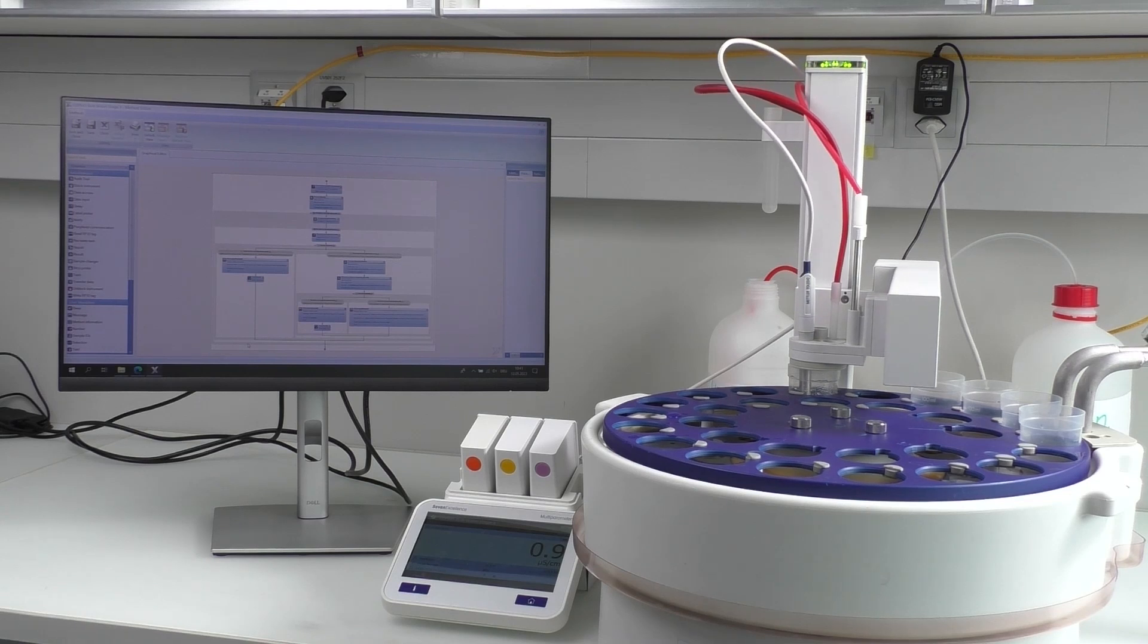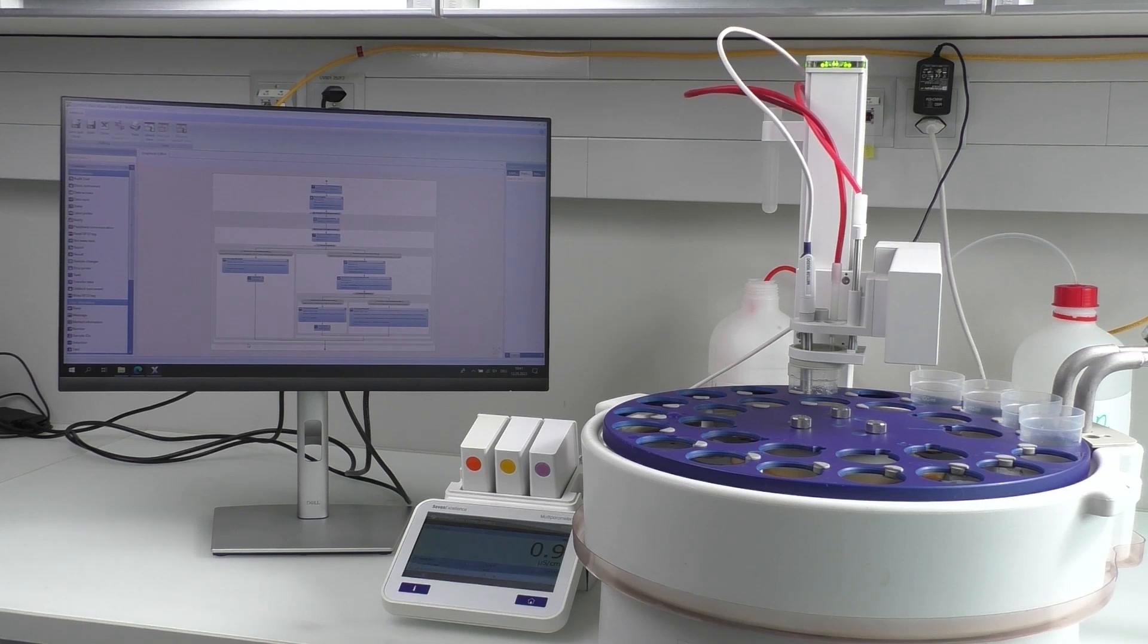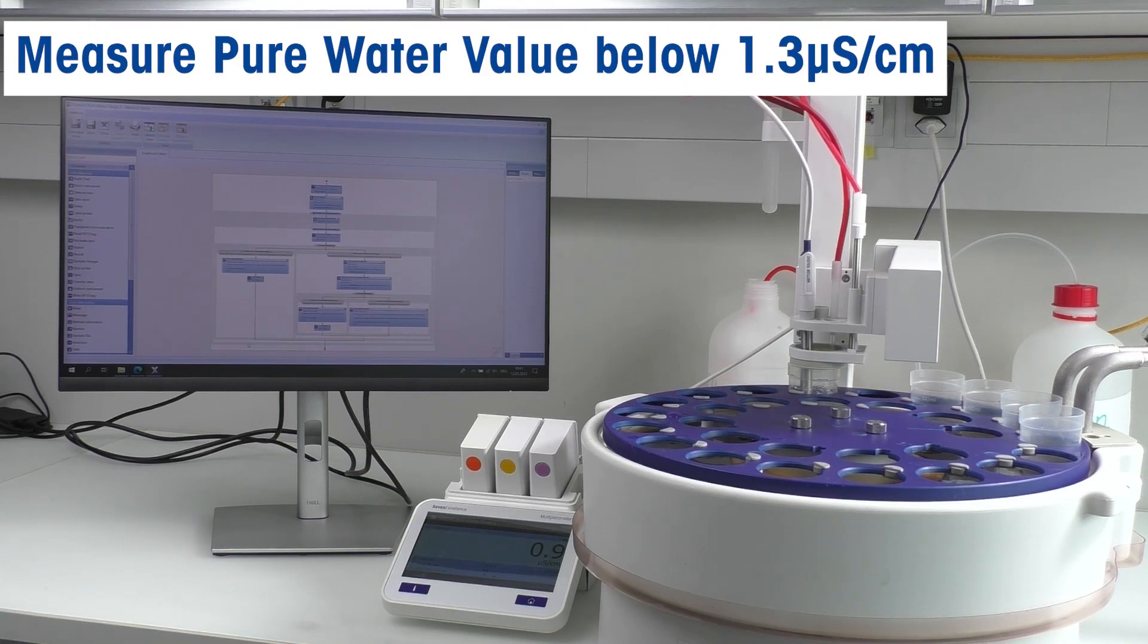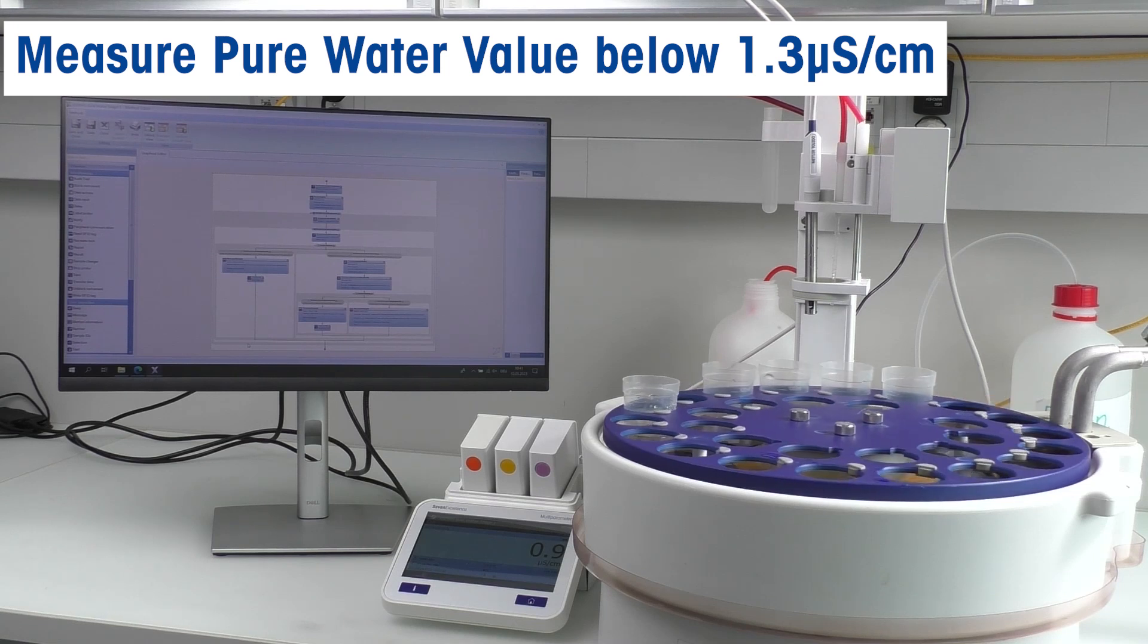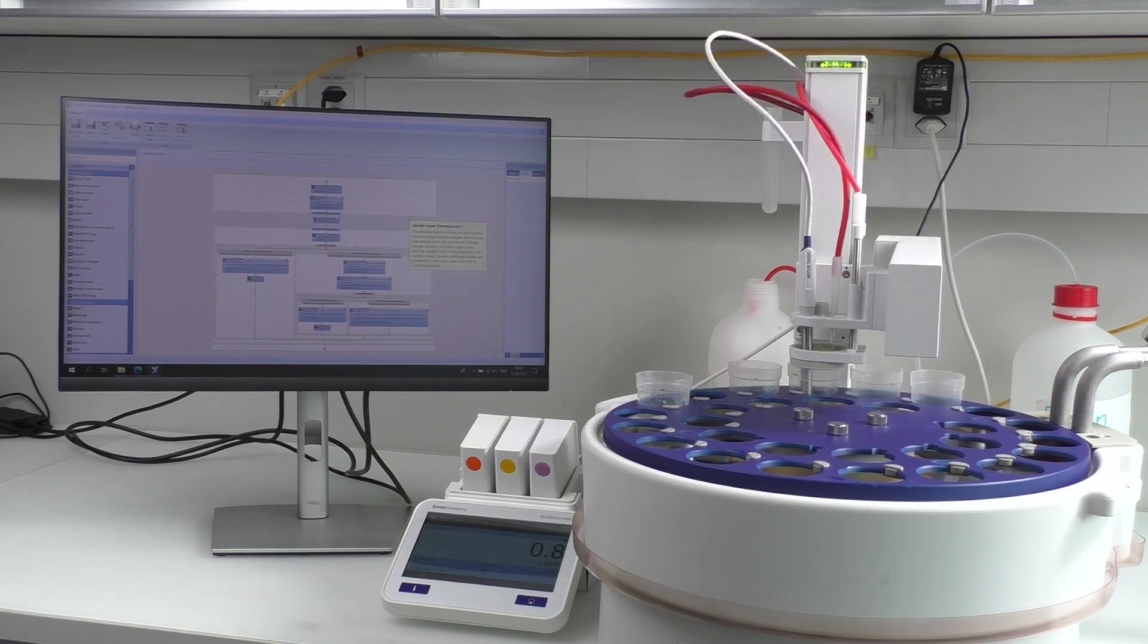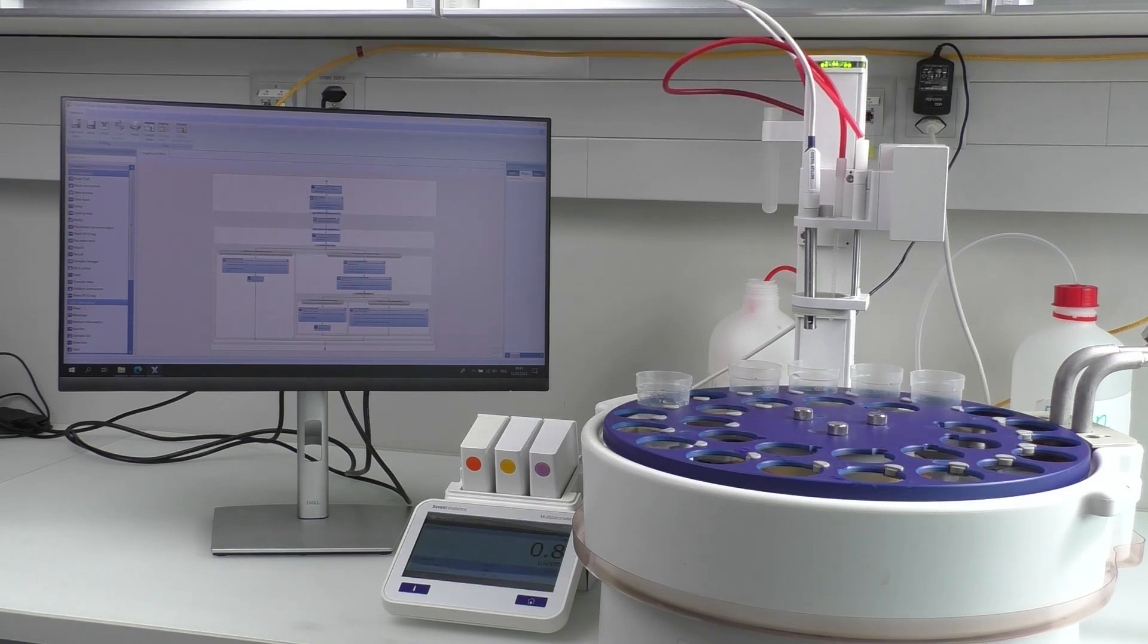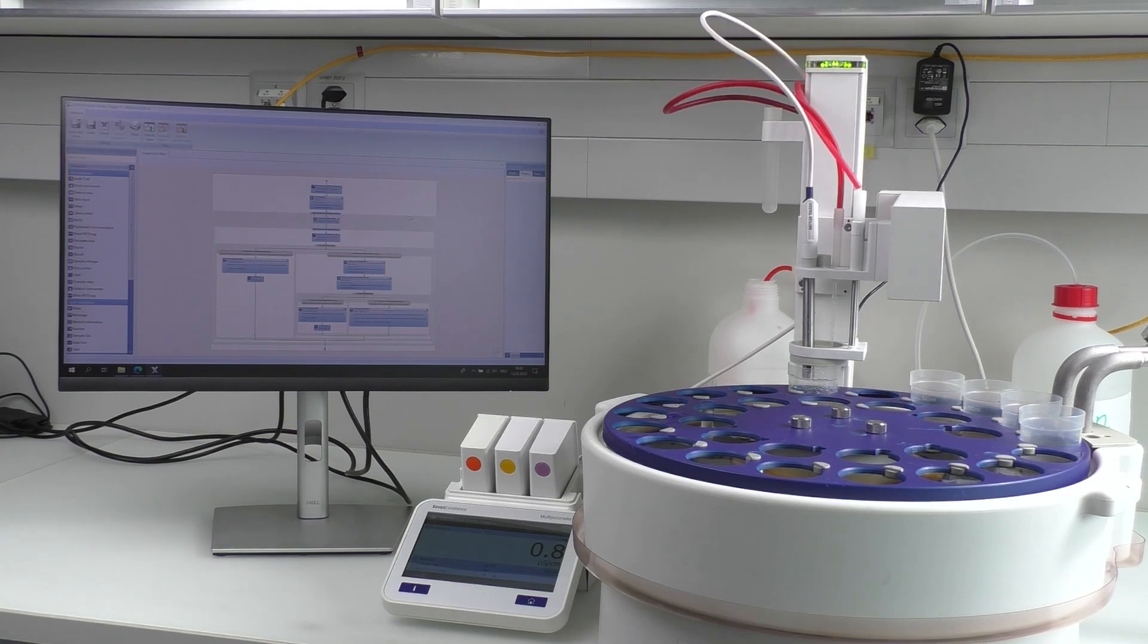In order to be compliant with USP645, the conductivity limit should not exceed 1.3 microsiemens per centimeter at the temperature of 25 degrees Celsius. Using the water bath, we can maintain a constant temperature. The InMotion will automatically move from sample to sample, and PowerShower cleans the conductivity sensor before the next measurement.